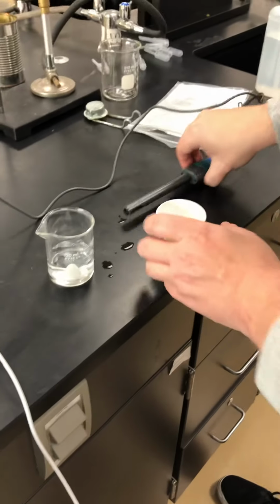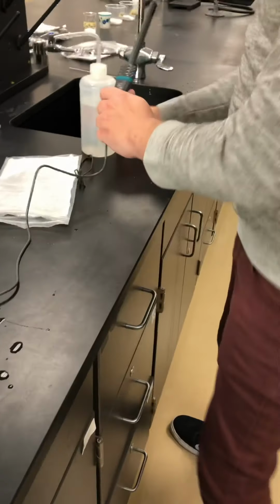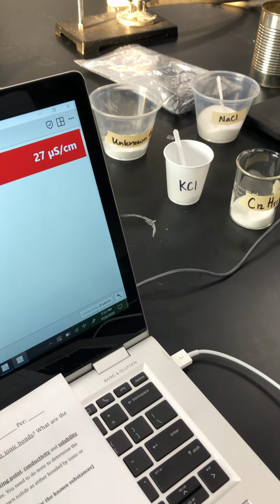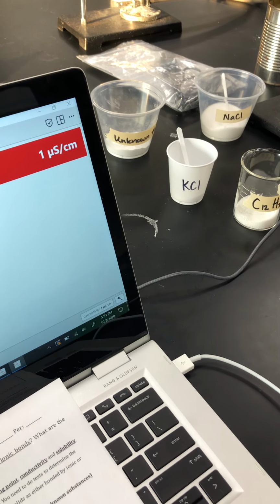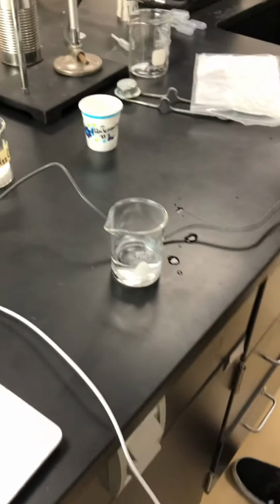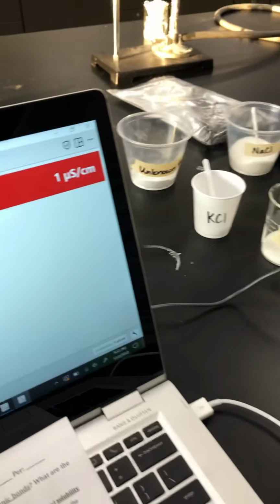Now we're going to test the conductivity. I'm going to rinse this off again because it's not at 0. I'm going to make sure it's as clean as possible so we get accurate results. Good. That's reset at 0. Let's go ahead and test this one.